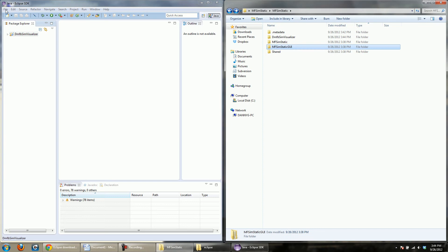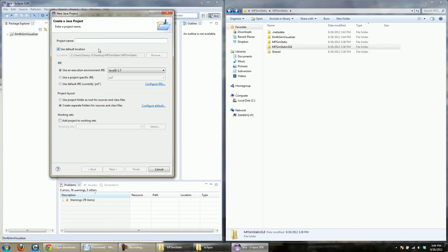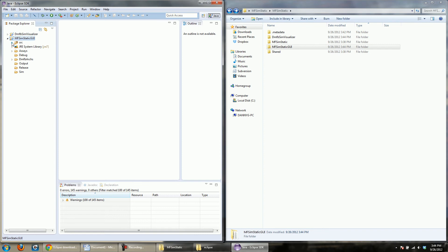Now let's make a project for the other Java project. Go to File > New Java Project again and name it the same as the folder: MFSimStaticGUI. Based on the existing source, go ahead and click Finish. Just to make sure it worked, go and look at the source to see the different packages and source files that are there.